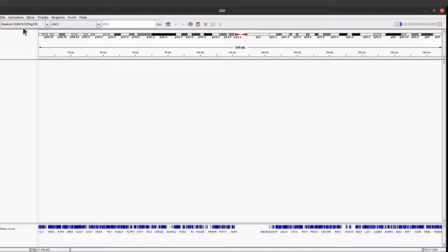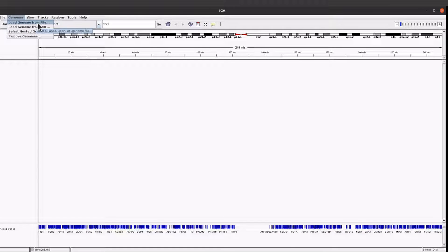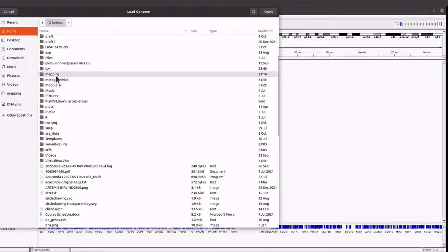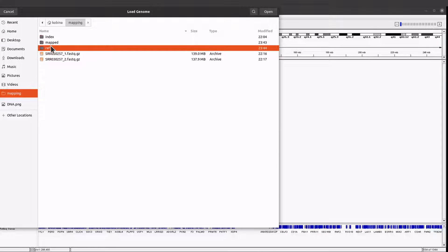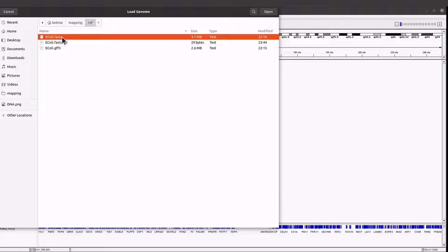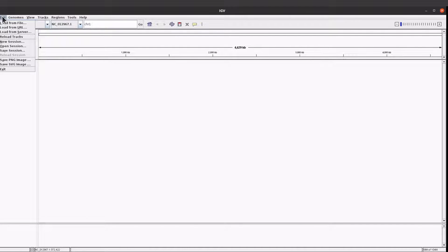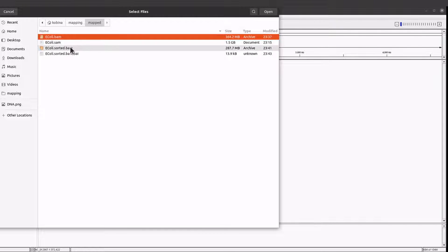When we are here, if you want to load the reference sequence you come to Genomes and then go to Load from File. Then you select your genome. I'm going to select my reference sequence. So I have loaded the reference sequence. Now I will also open the BAM file - I go to File, then Load from File, and load my BAM file.